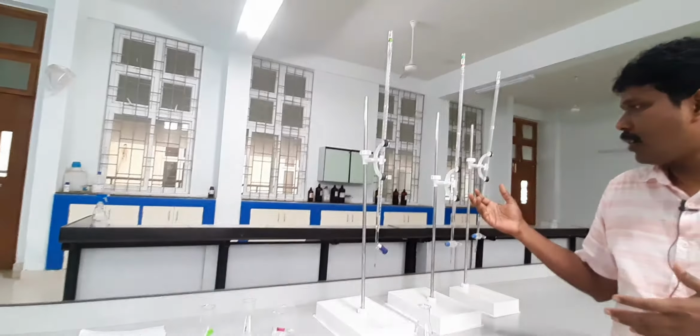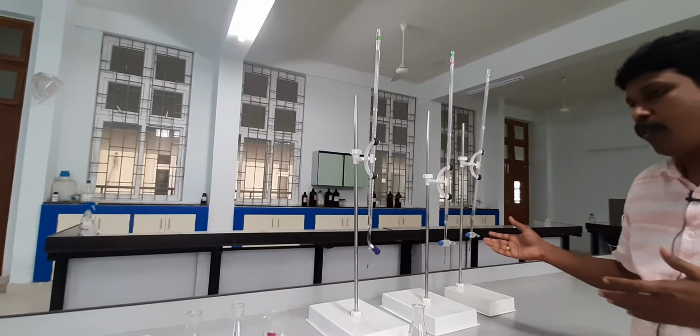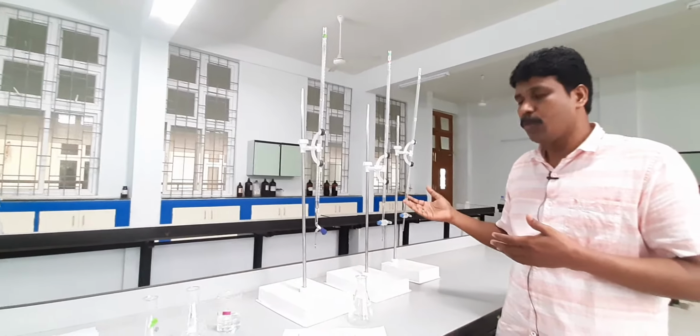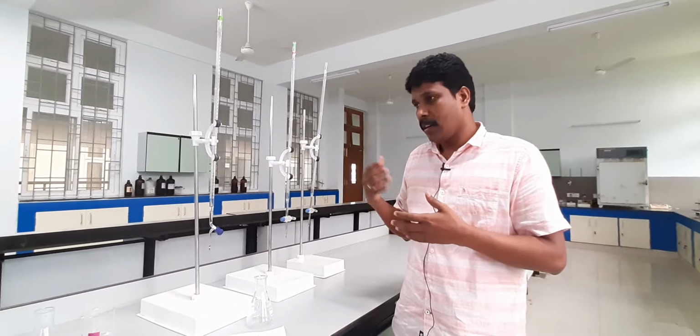of acetic acid and chloroform, to which we will add the water, and at a certain point what we see is that there is an end point. In this case the end point is nothing but turbidity. Okay. So, as you keep on adding the water to the 2 component system, it becomes turbid. That means we have reached the end point.